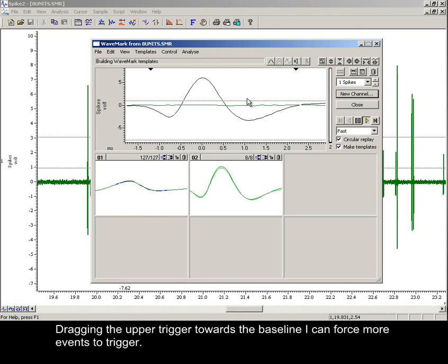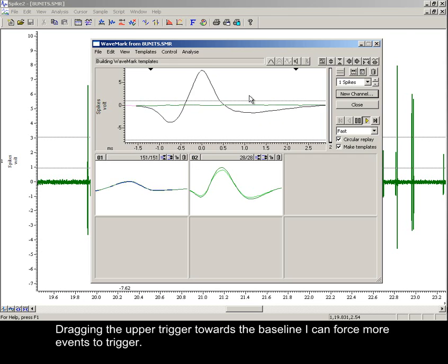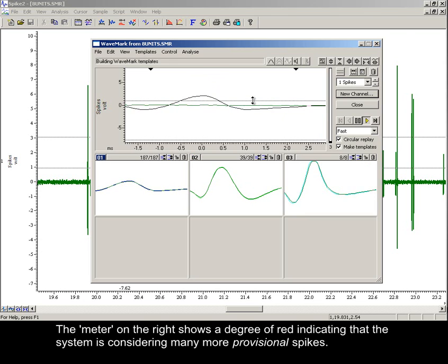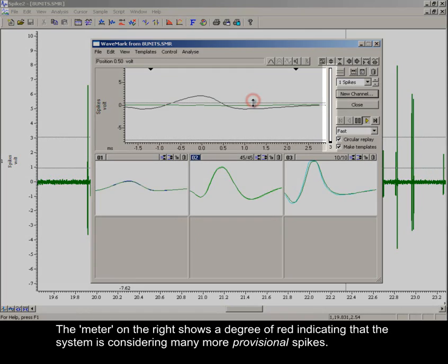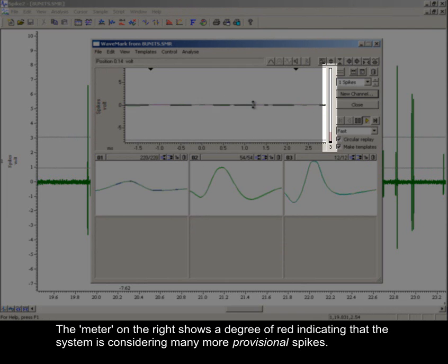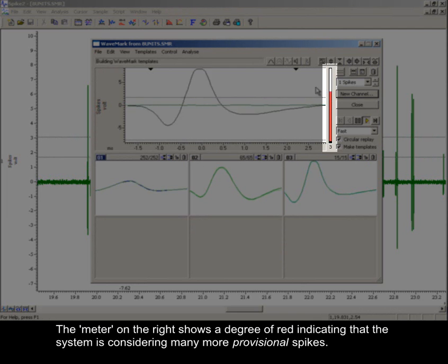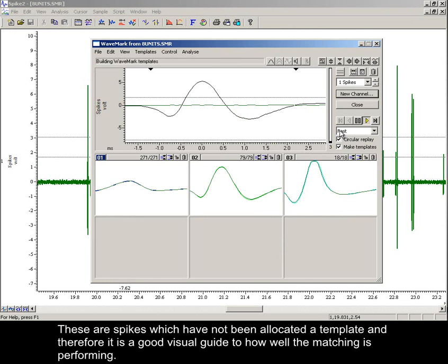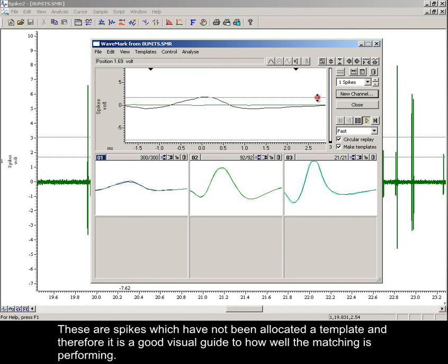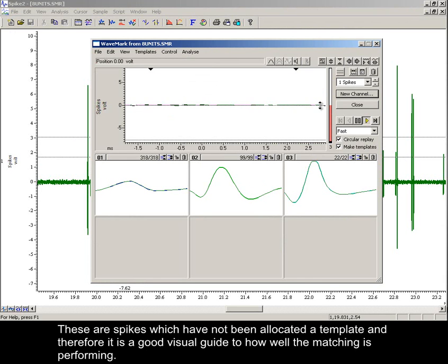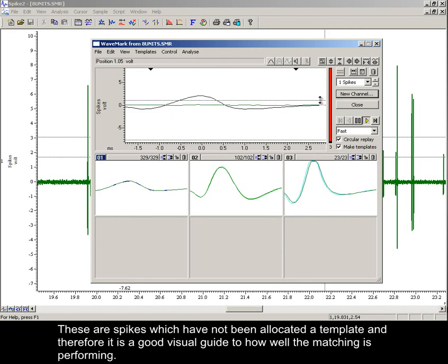Dragging the upper trigger towards the baseline, I can force more events to trigger. The meter on the right shows a degree of red, indicating that the system is considering many more provisional spikes. These are spikes which have not been allocated to templates, and therefore it's a good visual guide to how well the matching is performing.